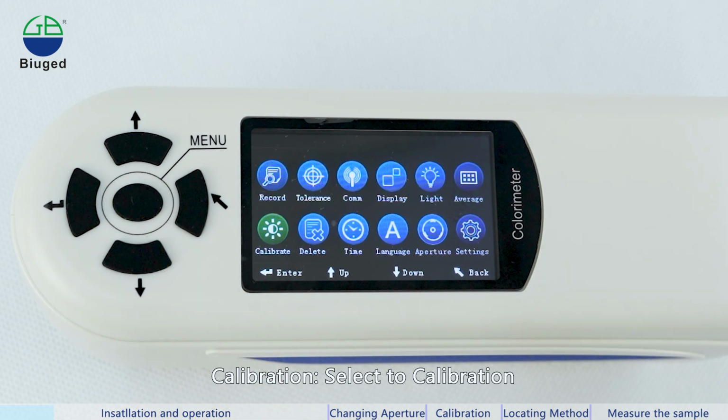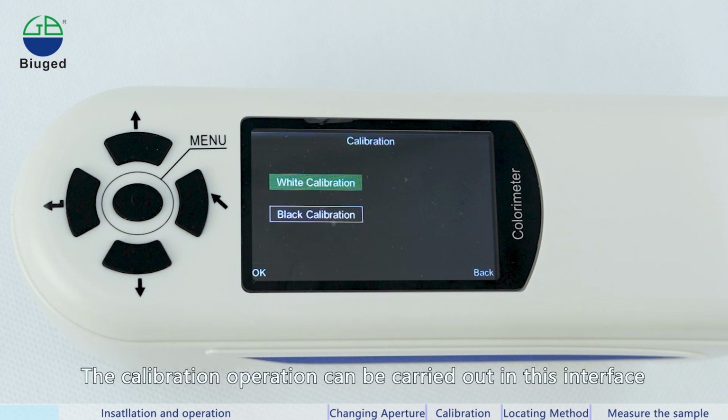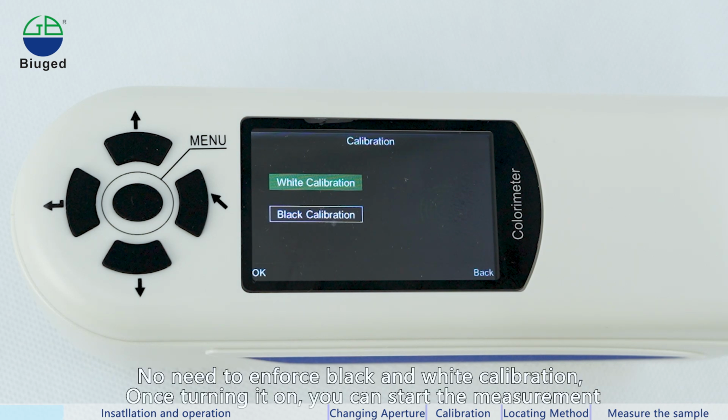Calibration, select Calibration. Click the Enter button to enter the calibration interface. The calibration operation can be carried out in this interface. There is no need to enforce black and white calibration. Once turned on, you can start the measurement.